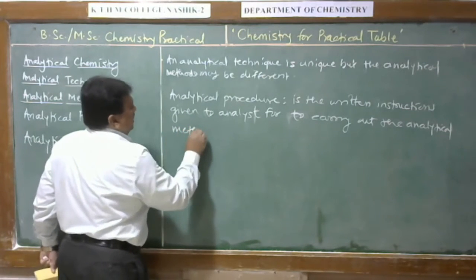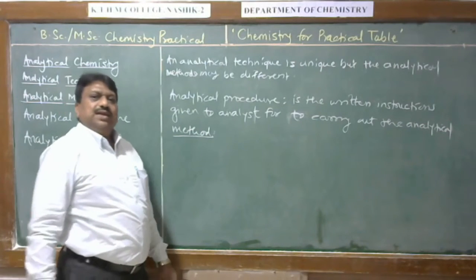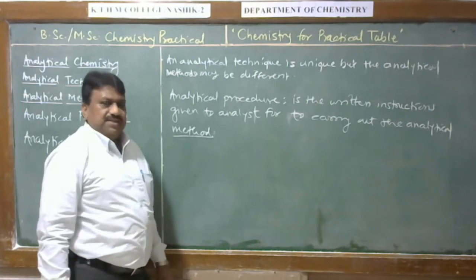Therefore, here procedure is a written instructions given to the chemist or analyst to carry out that method. That is an analytical method.